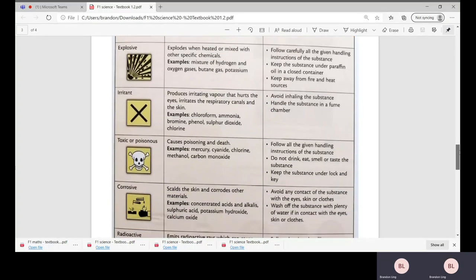Next we have the explosive diagram. The chemicals will explode when heated or mixed with other specific chemicals. For example, hydrogen gas, oxygen gas, butane gas, and also potassium. The instruction will be: follow carefully all the given handling instructions, keep the substance under paraffin oil in a closed container, and keep away from fire and heat sources.